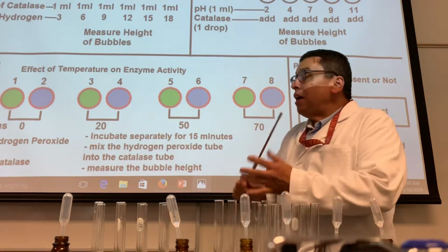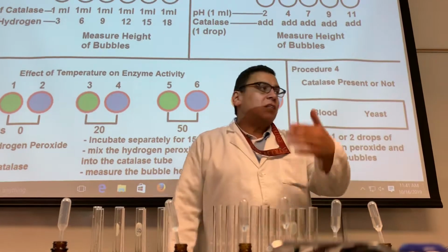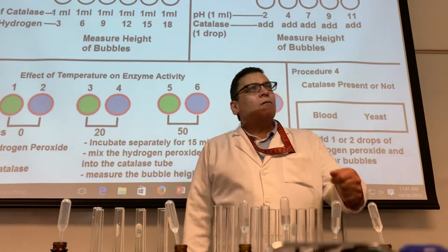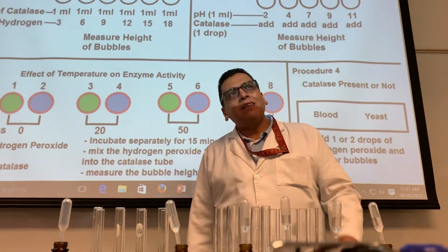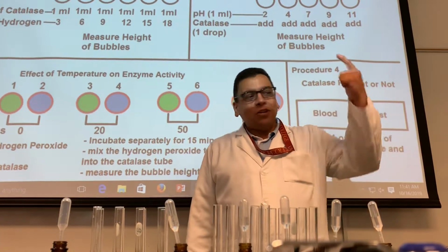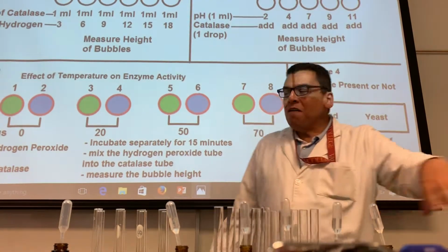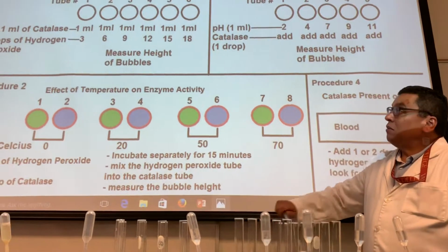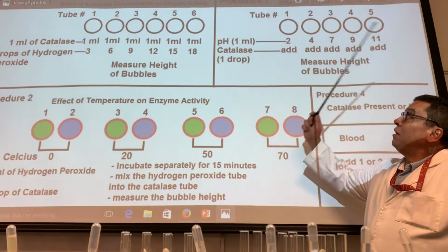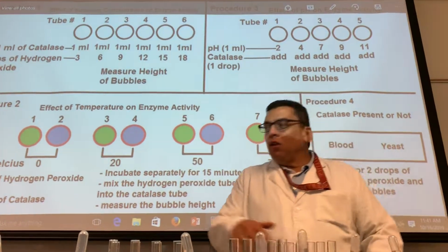Okay, so remember in chapter 5, we talked about we can denature proteins using temperature. But we also said changes in pH can also denature proteins. So we're going to test that one out too. What was the third thing that we said that can denature proteins? Heat, pH, salt. Well, we're not doing salt today, okay? So we're doing temperature to denature proteins and pH. Sounds good? Yep.